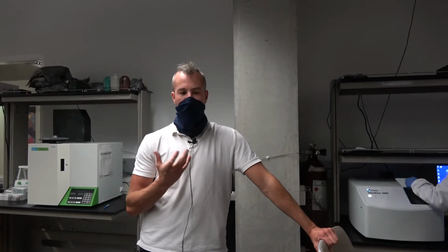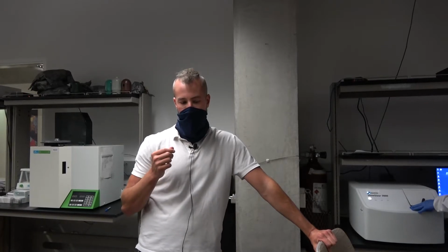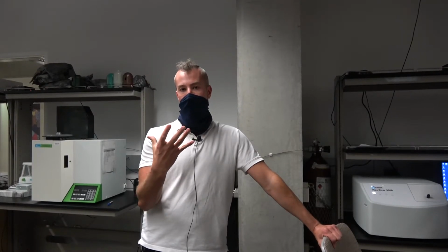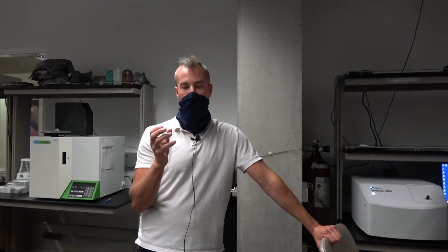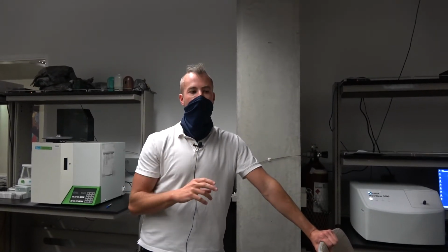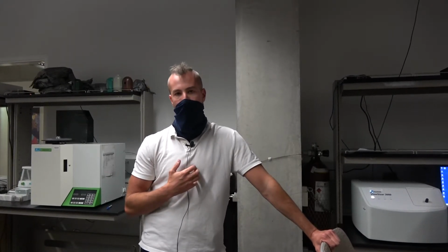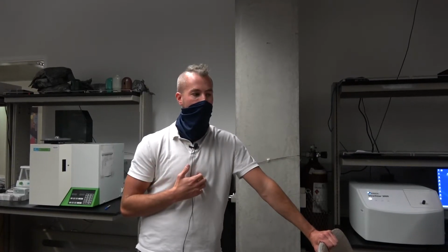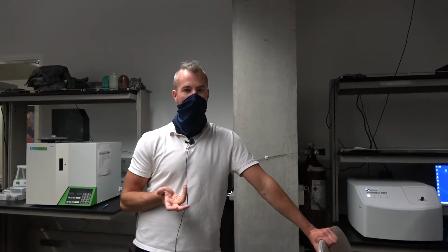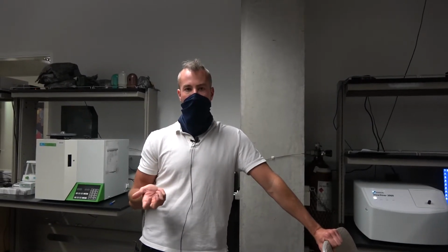So if you think about what we're doing in dark field microscopy, right, we can't necessarily see individual tiny nanometer sized particles, but we can see the photons that they scatter, right? This is known as the airy disk, if you've ever taken a microscopy course. And so that's why in dark field microscopy you can see objects that are much, much smaller than the resolution limit of the microscope. So what we're going to do here is simply look at scattered photons. And this technique has been around for a while in terms of conventional nanoparticle tracking analysis.